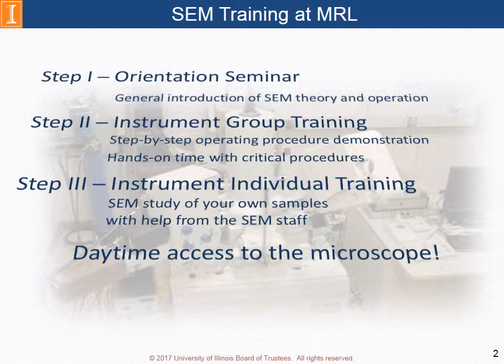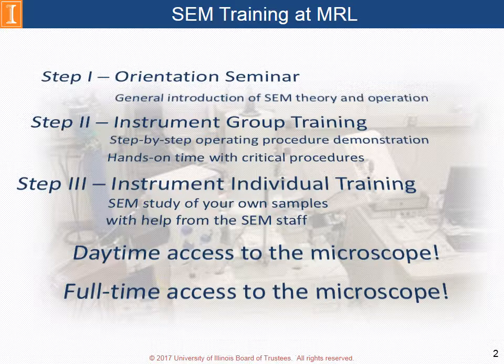After the individual training, you may get daytime access to the microscope. Then you will need to finish a few self-use sessions, at least 10 hours on the instrument, before you can apply for full-time access to the microscope.